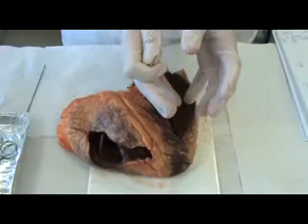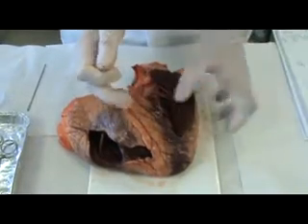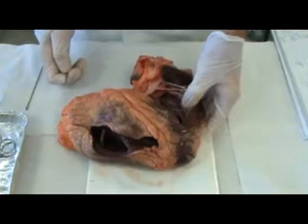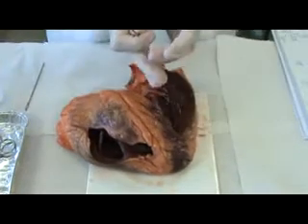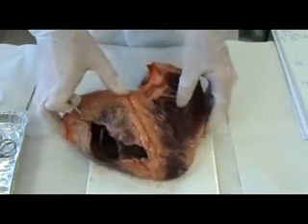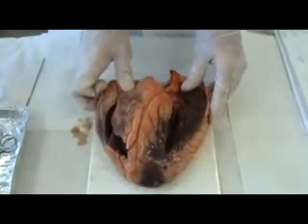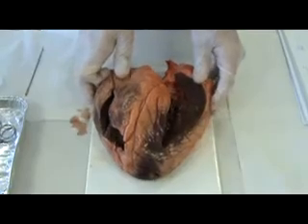So as it fills with blood, the chamber stretches, and these provide that ability to stretch. The recoil of the heart as it contracts is also important in order to generate the power to force the blood out of the heart into the various blood vessels.